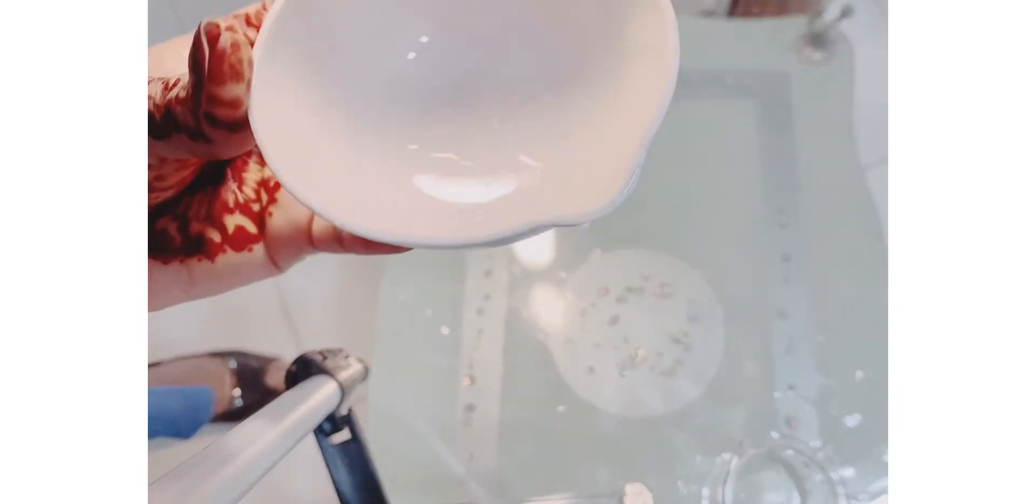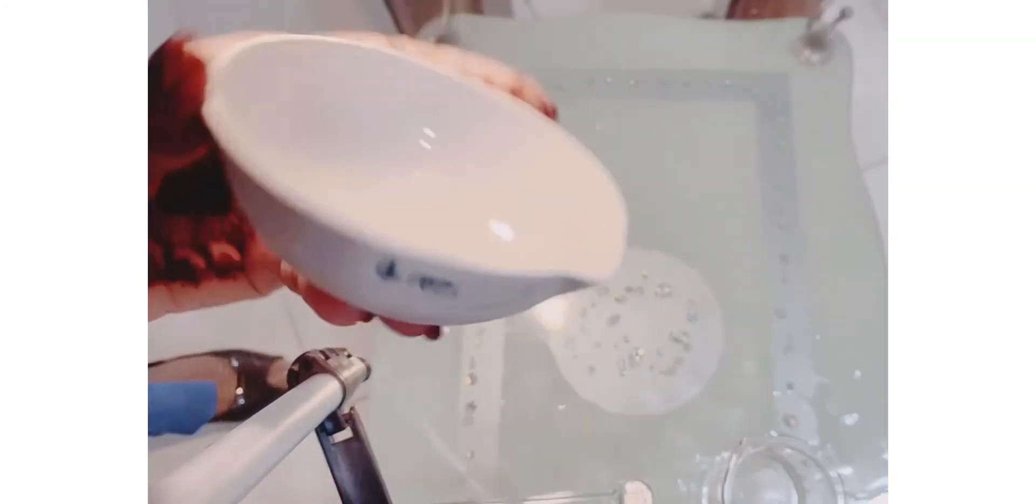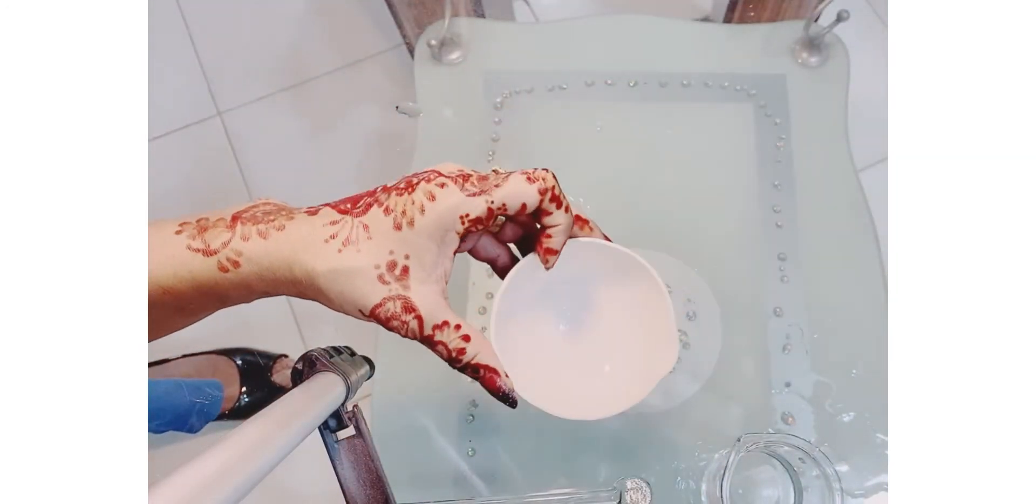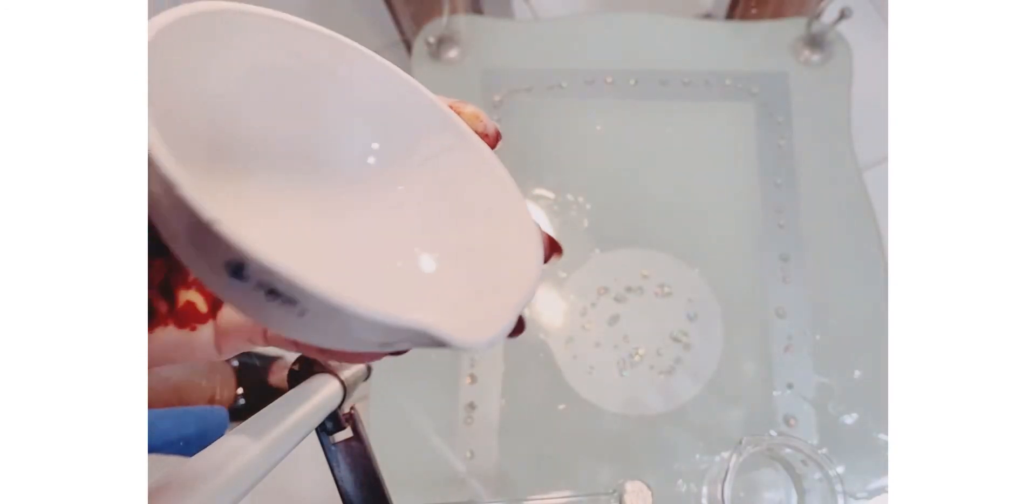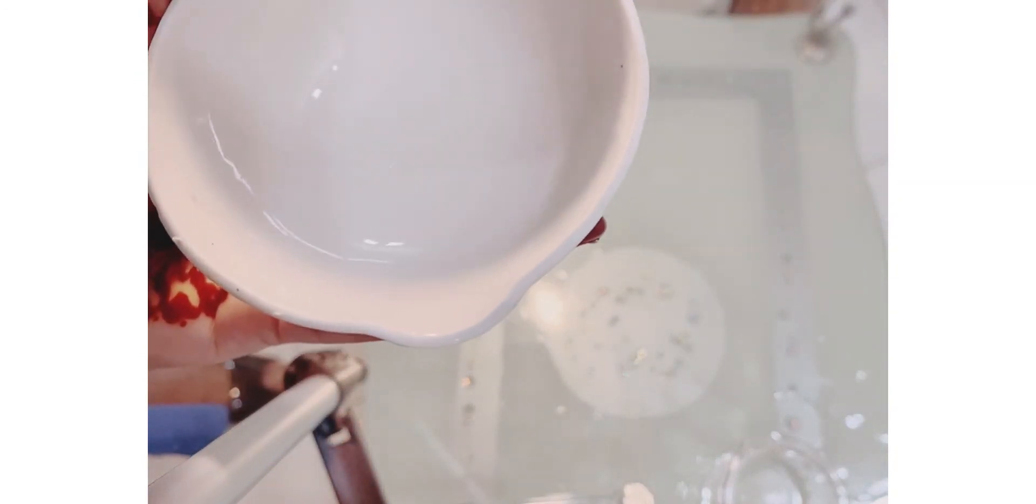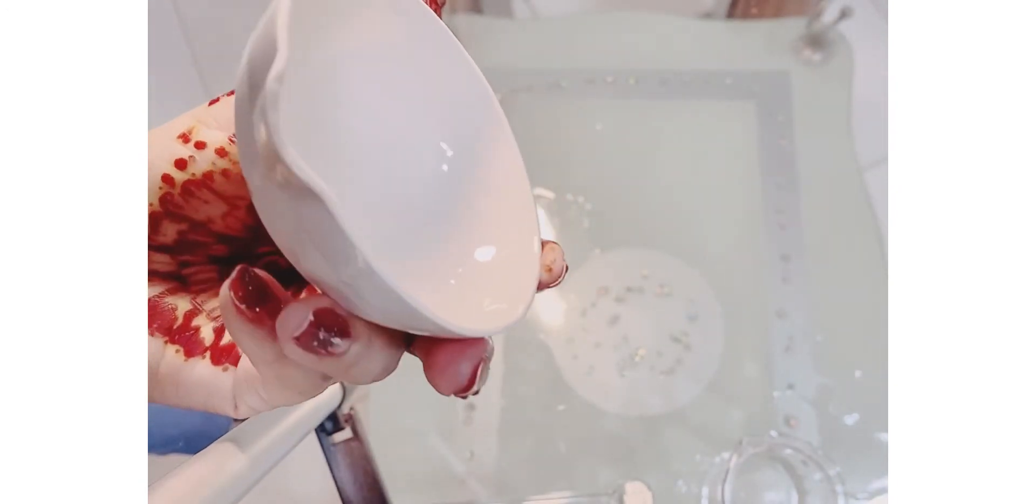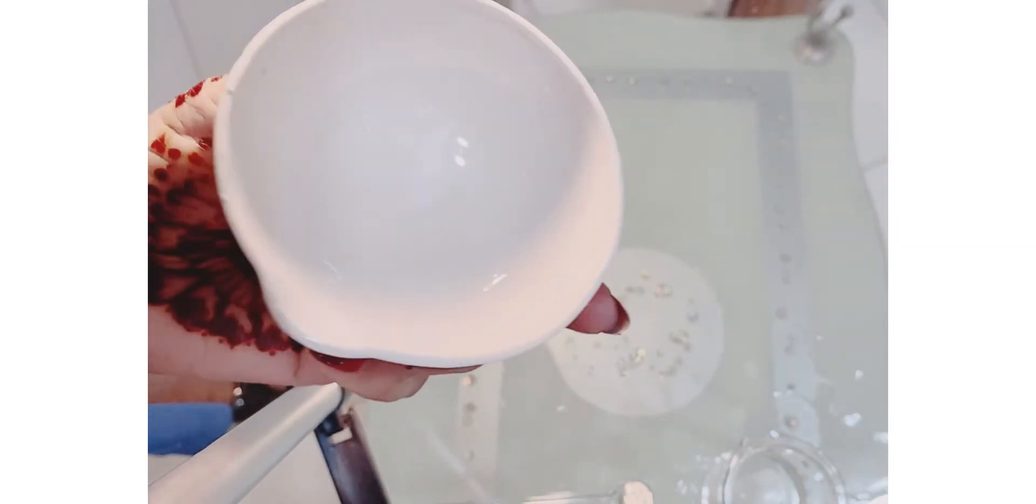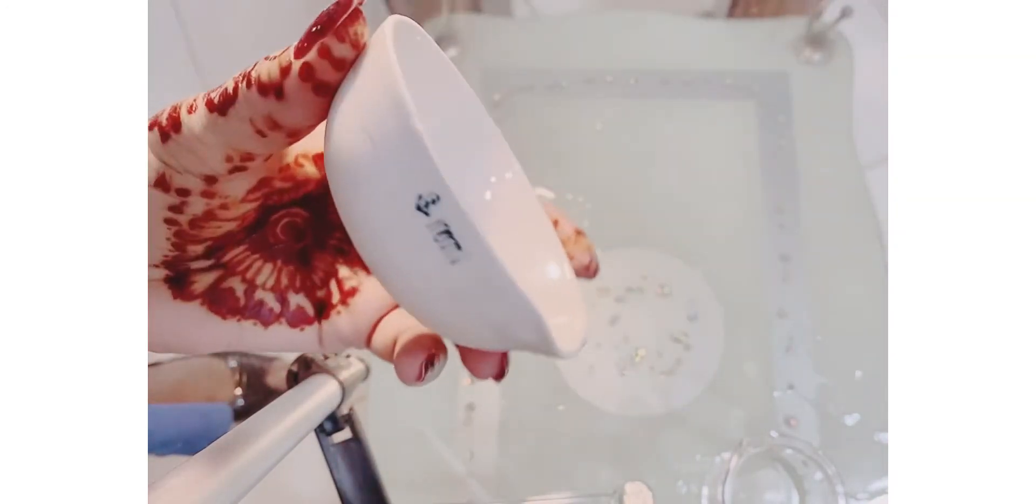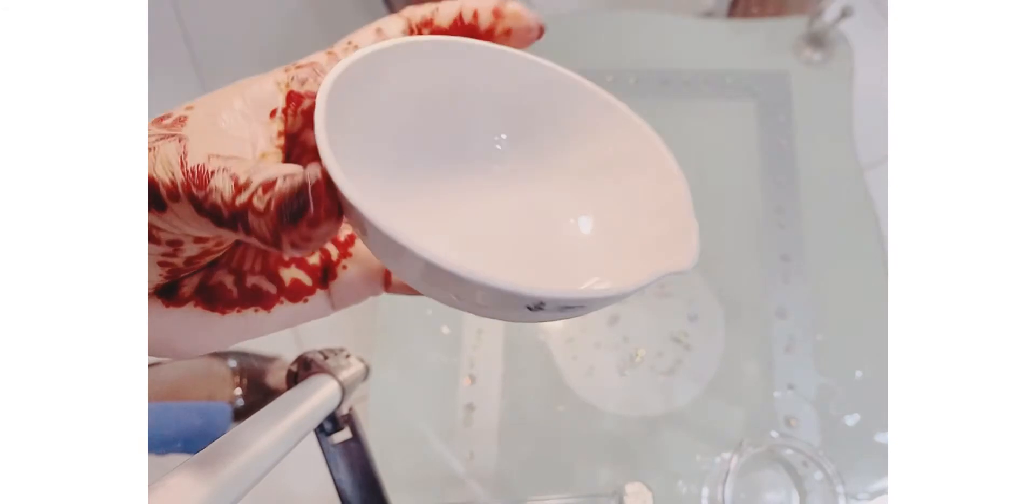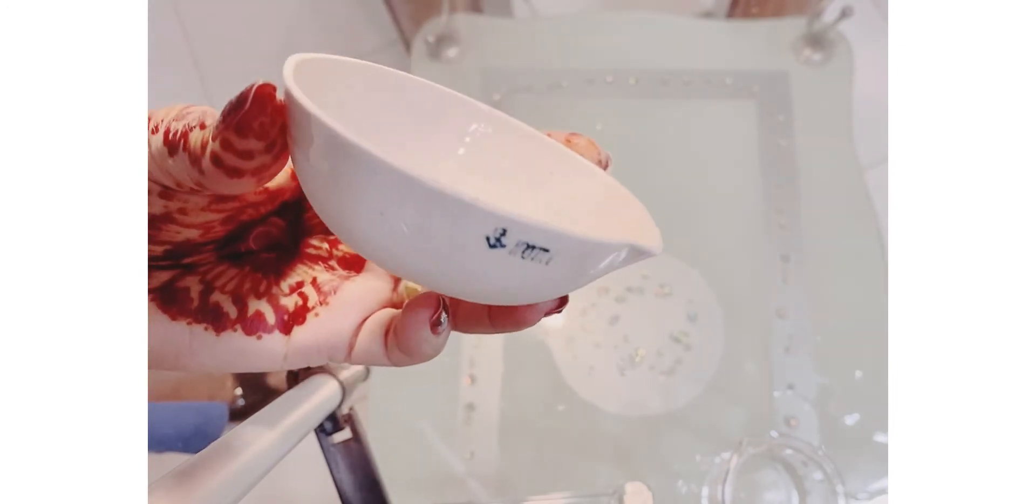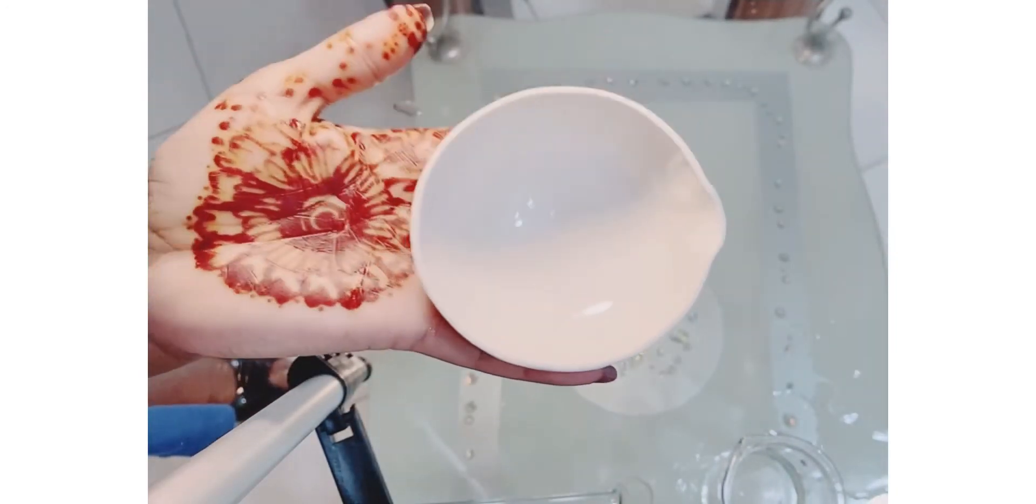So I hope you like this short review of this evaporating dish or china dish. Today, as I found it, I thought that I must share my experiences of using this china dish with you, my viewers, with my students. Because at a beginner's level, in the initial stages, you don't know what is the purpose of this dish. So now I have explained you multiple purposes of this evaporating dish, which is made up of porcelain, and the glass that is used is borosilicate glass mostly. And it's flat and it helps basically to evaporate solvents much easier rather than any other containers.